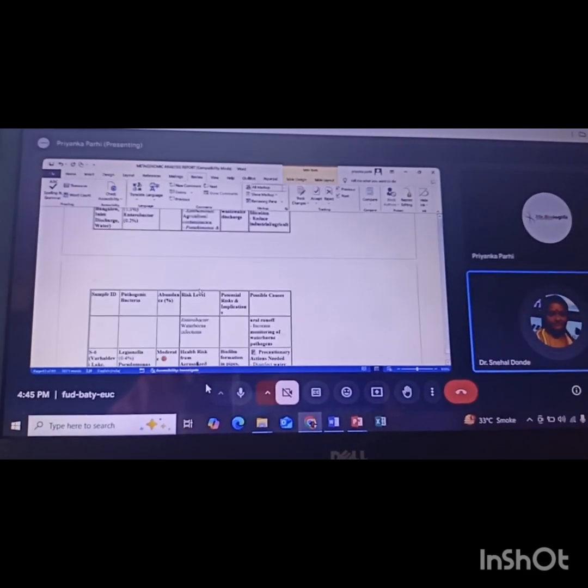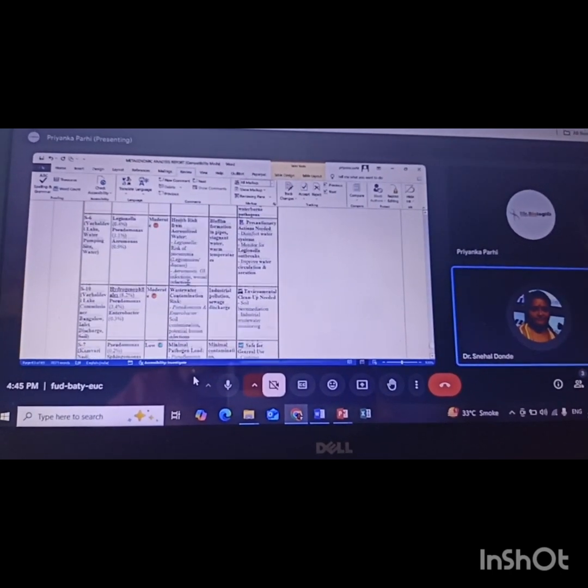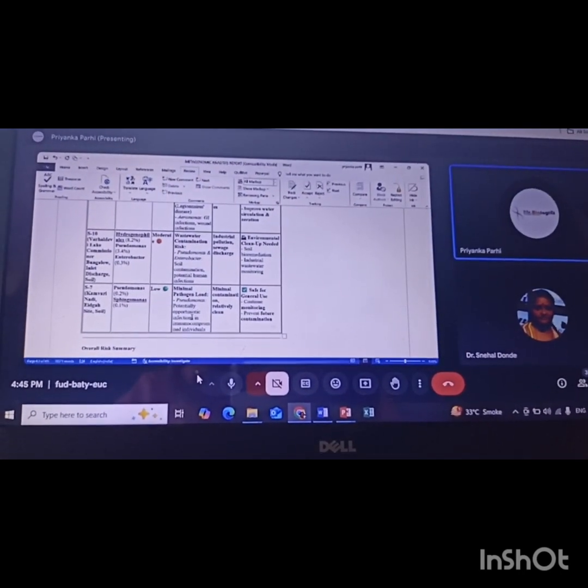Because we saw that in the peak it is very high. So that's what I was trying to say: suppose I get S7, what does it stand for? Suppose it's Pseudomonas. The peak might be for Pseudomonas, but there is no way to correlate that particular graph.